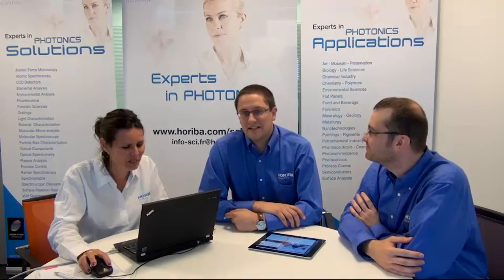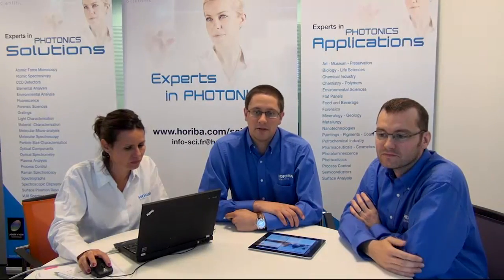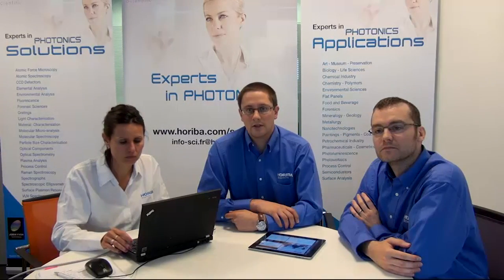Thank you. What is the difference between CCD and array detection? A little bit related to the previous question, but a CCD is really a two-dimensional detector, so you have pixels in two directions. For the array detection, it's more or less the sensitive components stacked together in one direction, but still, if it's in the direction of the spectrum, you can acquire the full spectrum in one shot.